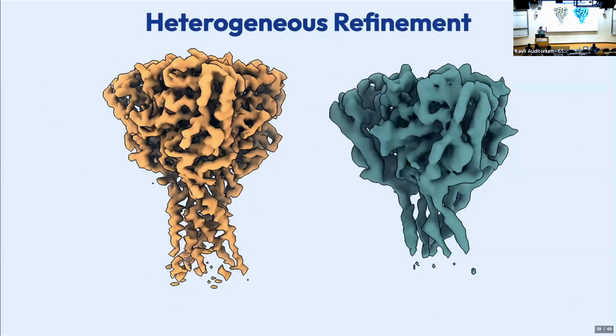We start with our consensus refinement, which has both apo particles and ligand-bound particles and junk particles. What this job did is it separated out the two, ligand-bound and apo, from the junk. And then the next job took ligand-bound and apo and made two separate maps of those.